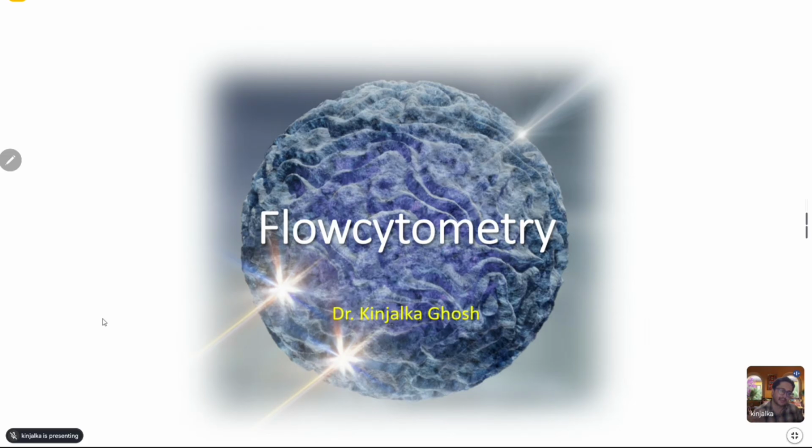and depending on the kind of cell or the kind of antigens that are reacting with antibodies tagged with fluorophores or colored complexes, different light gets scattered. So light gets scattered in two directions: forward scatter and side scatter. And then you have fluorescence, which is emitted light. Color is emitted.